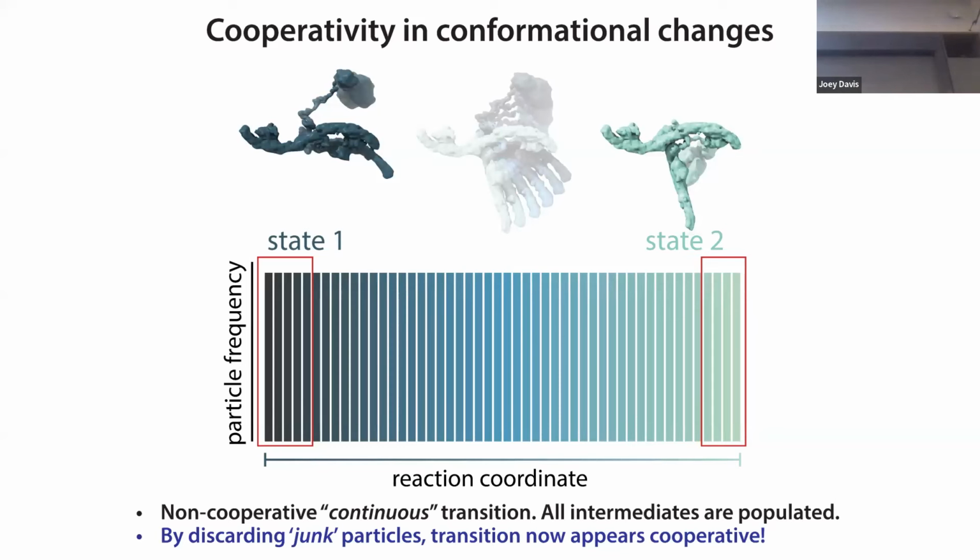And if you go and read cryo-EM papers, buried in a supplement, there will be an extended data figure 7 that shows their cryo-EM processing workflow. And they will typically say we extracted on the order of 2 million particles, and here's the structure that was representative, and there were 100,000 particles that went into it. And don't worry about all those other things. Maybe they were denatured, could be, or maybe they just threw away things that didn't. Okay. So this is the conundrum.